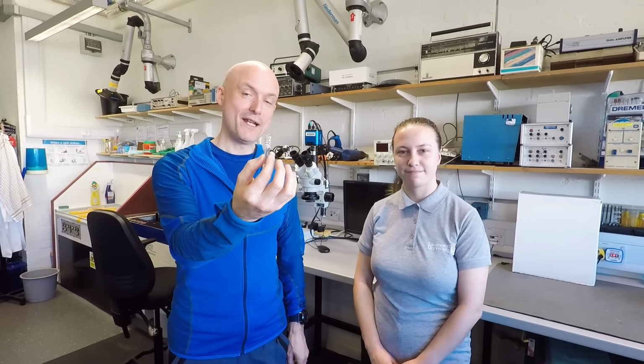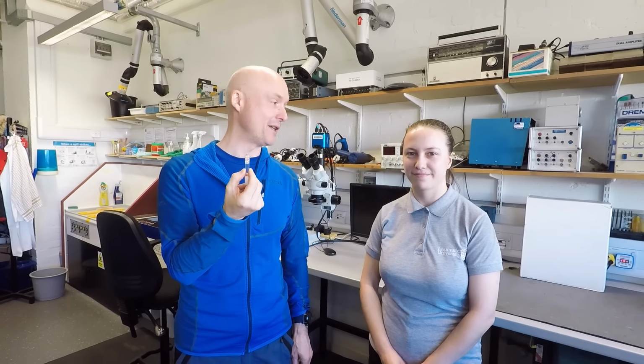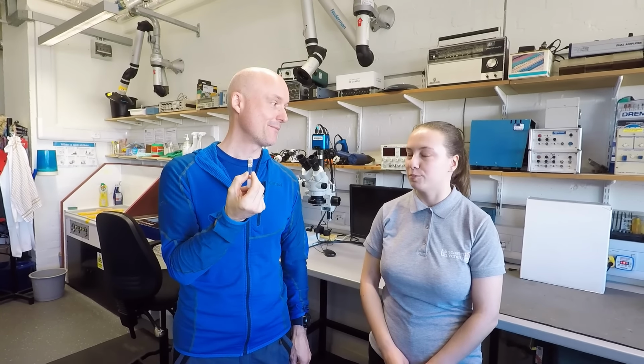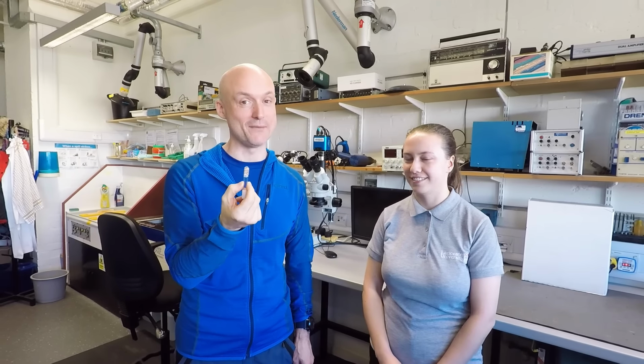So here is our resonator, built by Eve. Now, fortunately, we have an expert solderer in our midst at Lancaster University in the electronics workshop, Lucy. Hello. And Lucy has soldered a lot of these resonators for us. How many do you reckon you soldered, Lucy? Oh, it must be at least 50. A lot. Partly because we keep breaking them, but Lucy's here to save the day, so we're all good. So Lucy is going to show you how to solder one of these resonators.